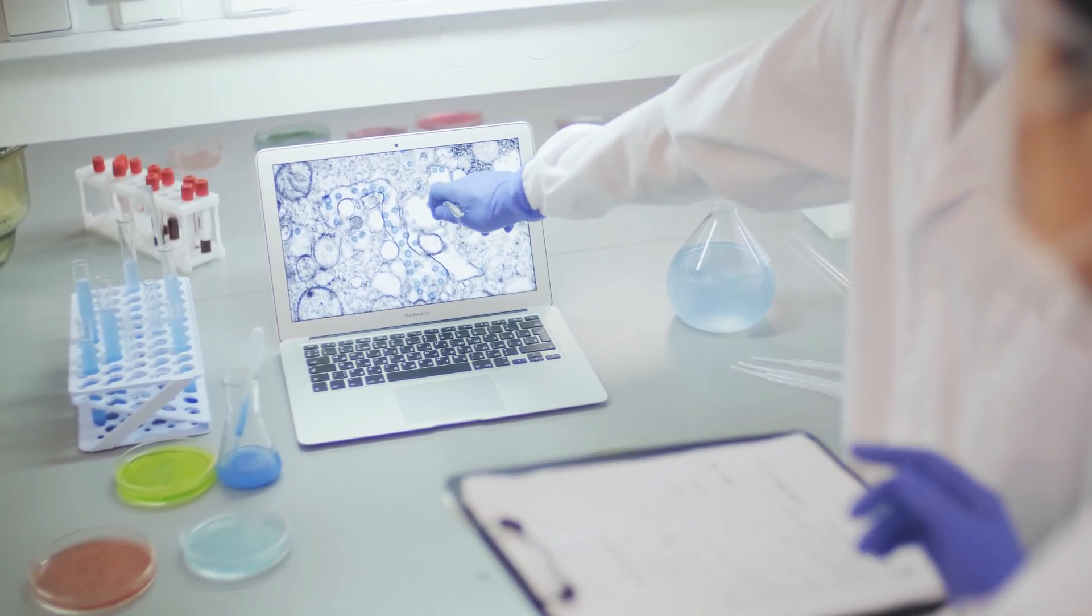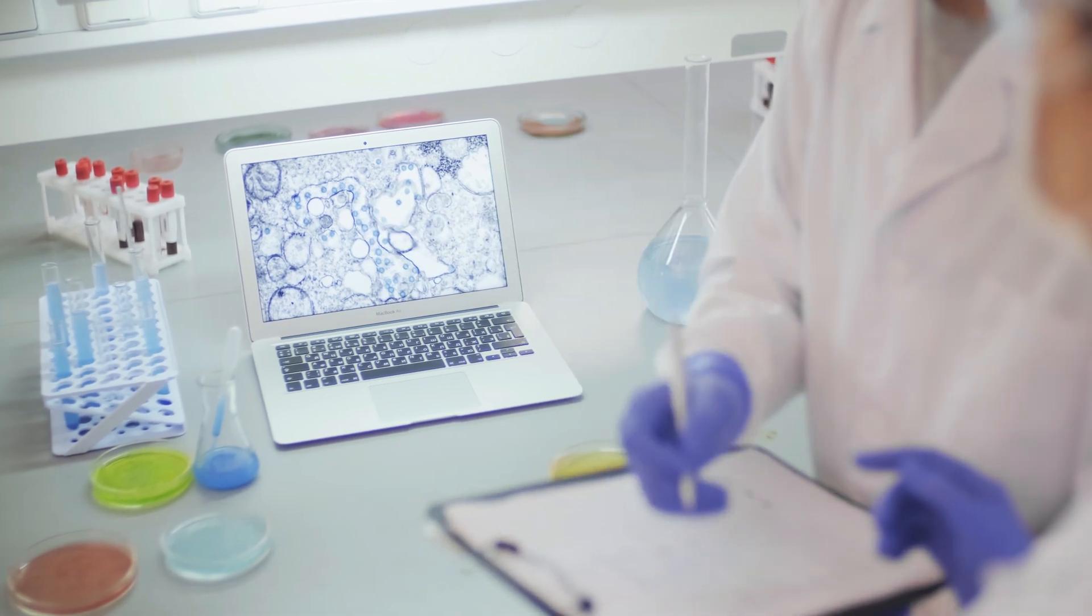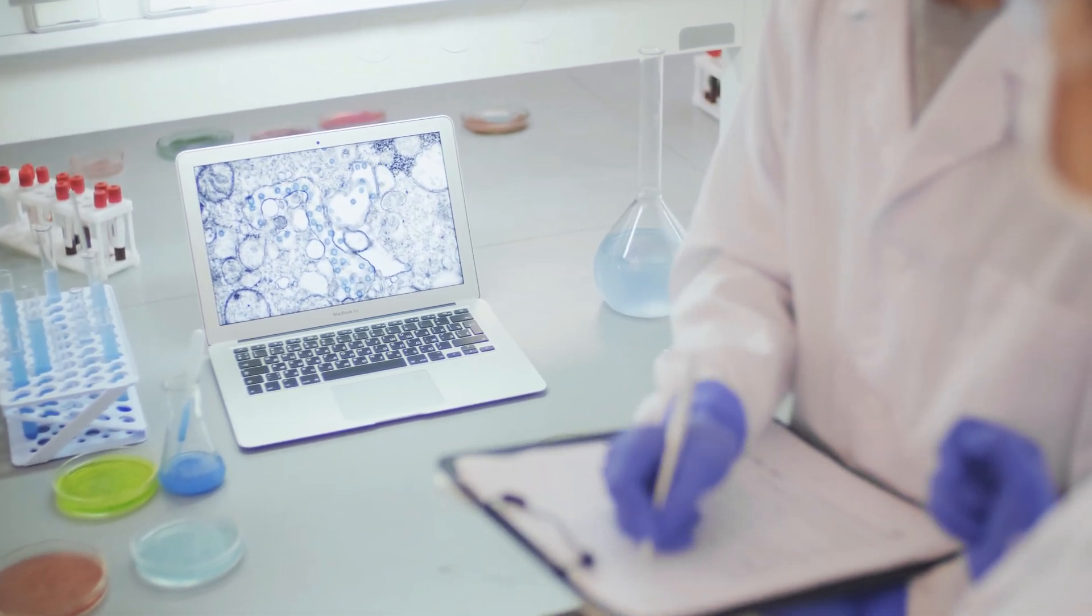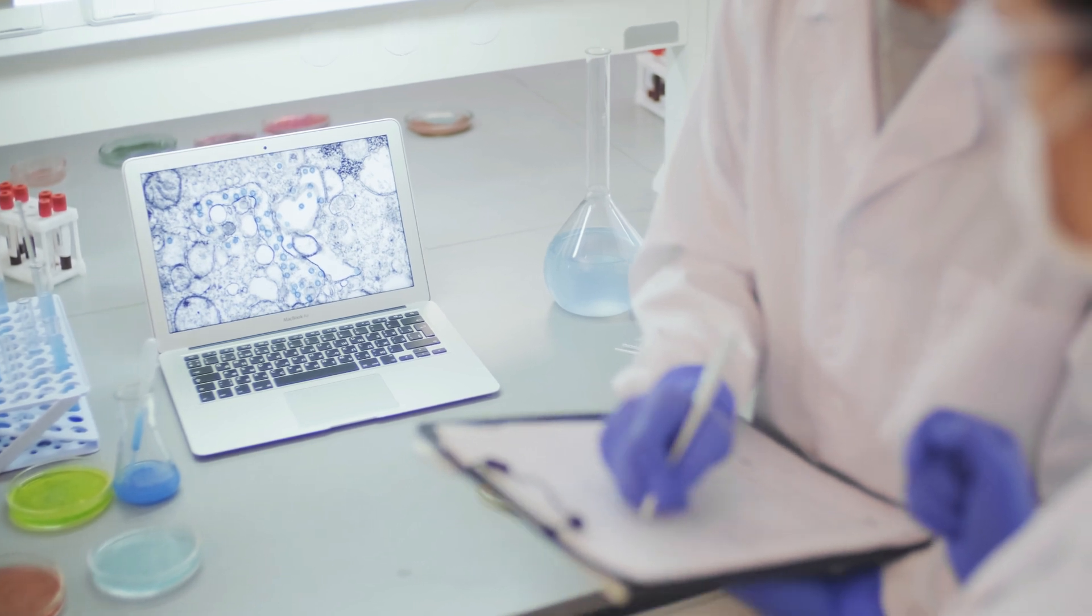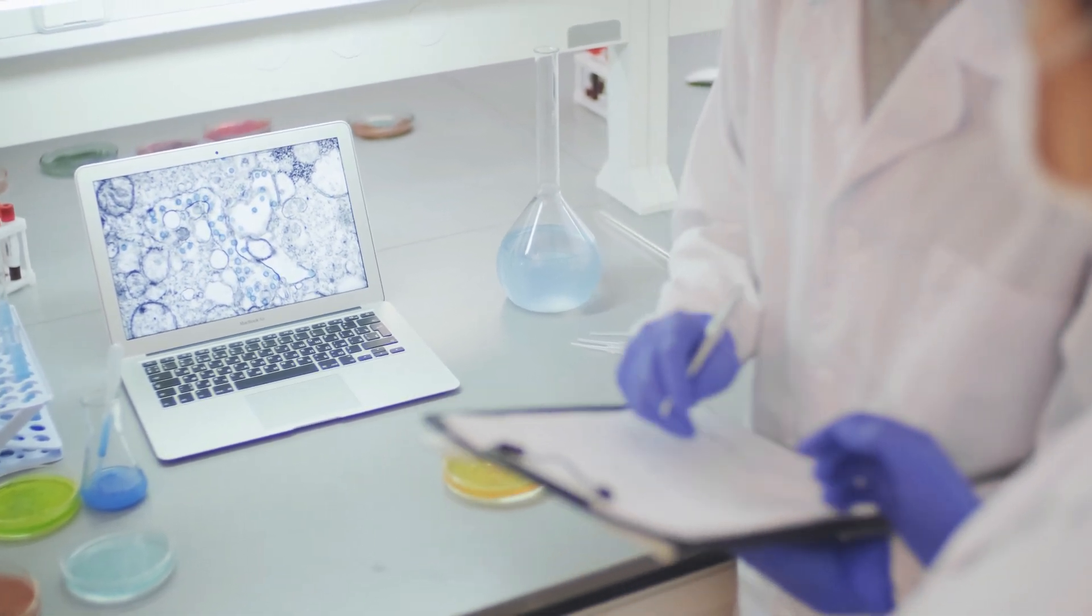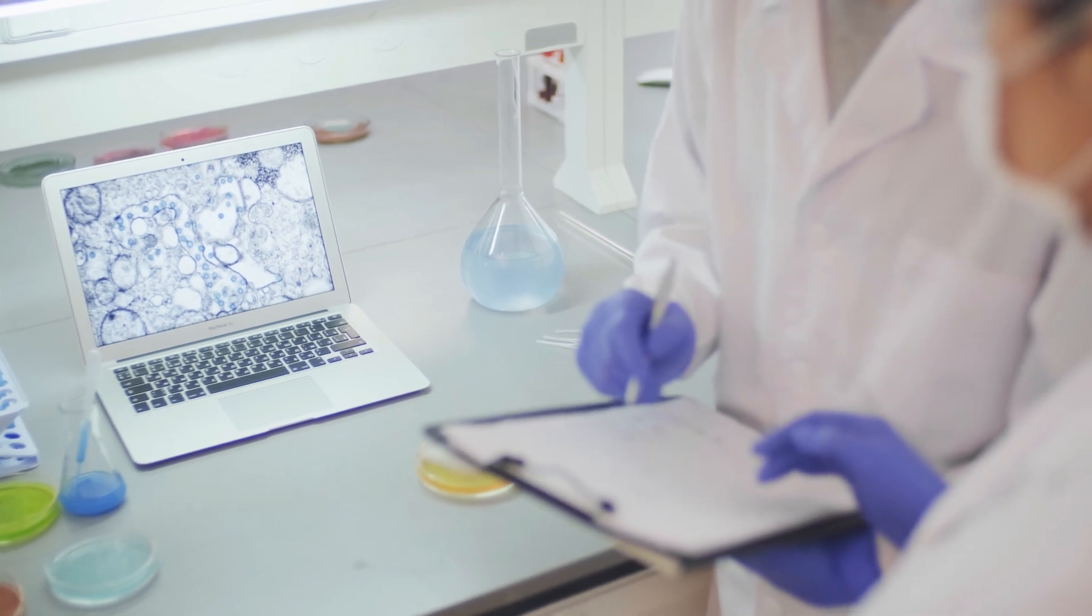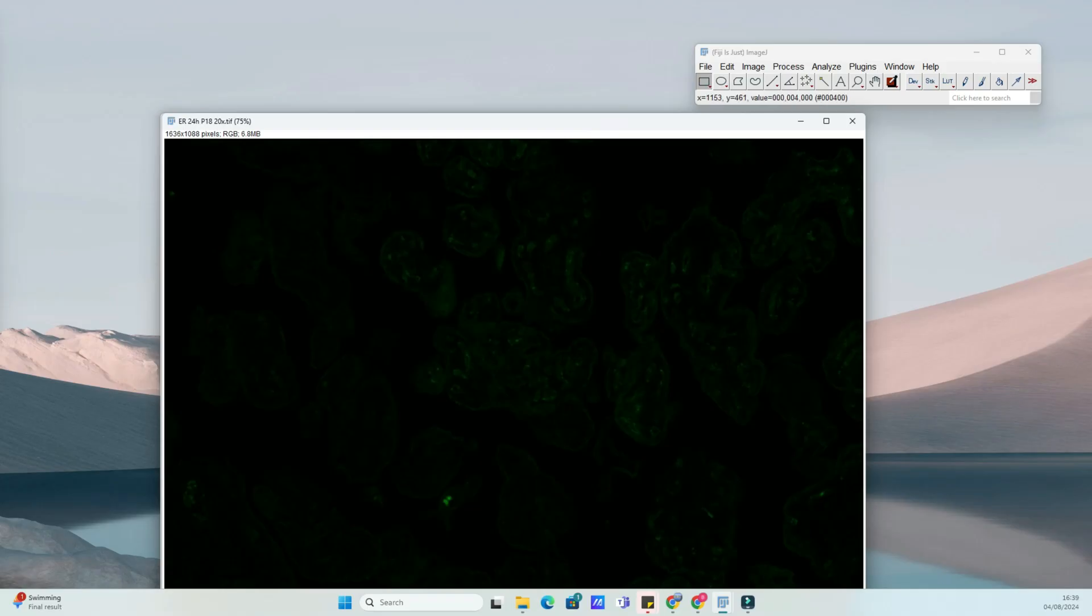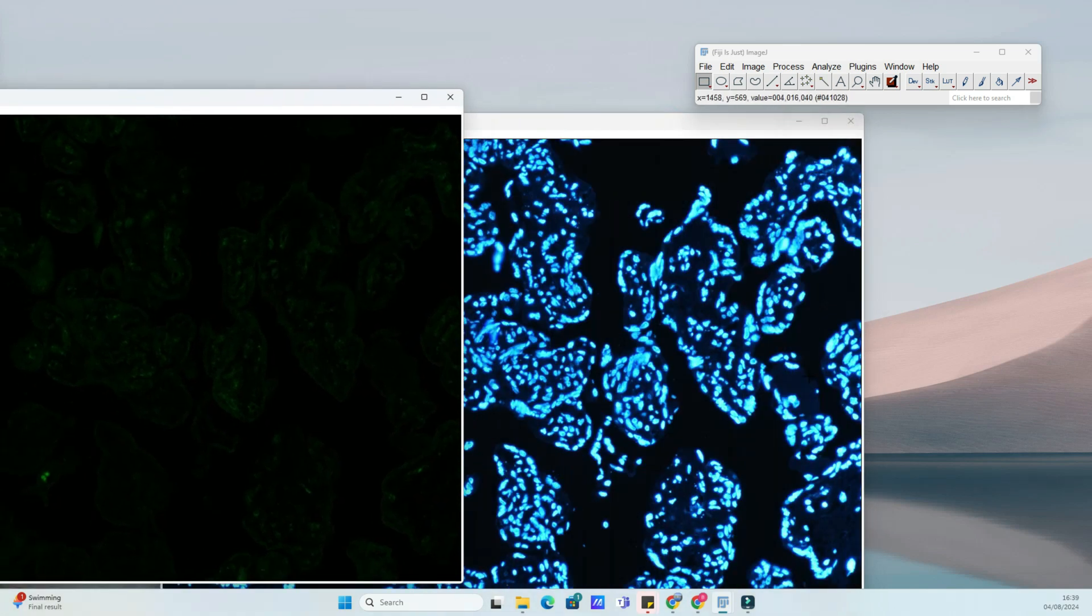Merging immunofluorescence images allows you to combine different fluorescent channels such as green for GFP, red for RFP, into one composite image. This is crucial for analyzing co-localization and interactions between different markers.